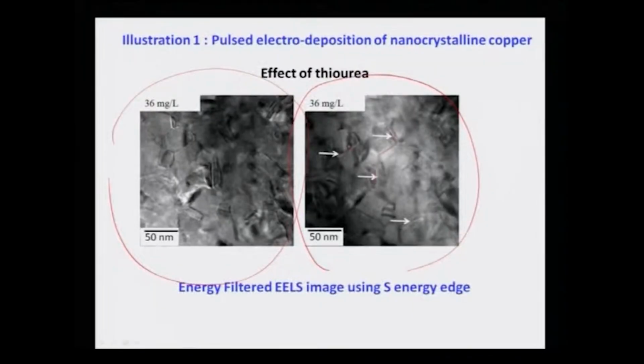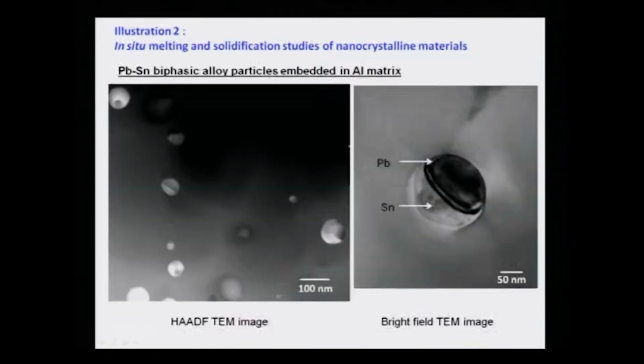Also, images can be formed in the STEM mode by using low energy secondary electrons, Auger electrons, or characteristic X-rays. The serial nature of these image signals provides the possibility of quantification, and the information can be correlated with the specimen composition, crystallography, as well as morphology.